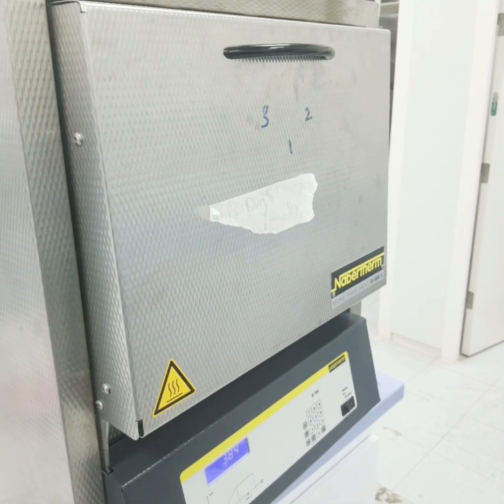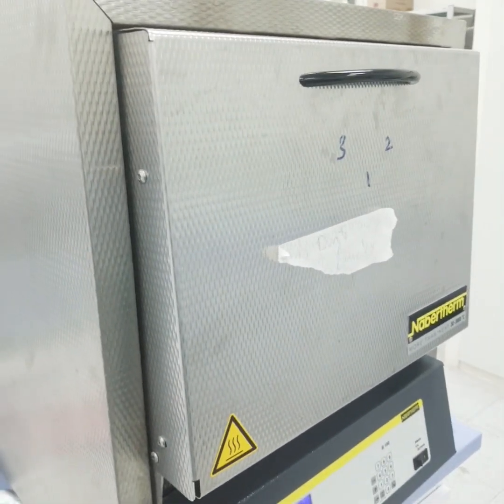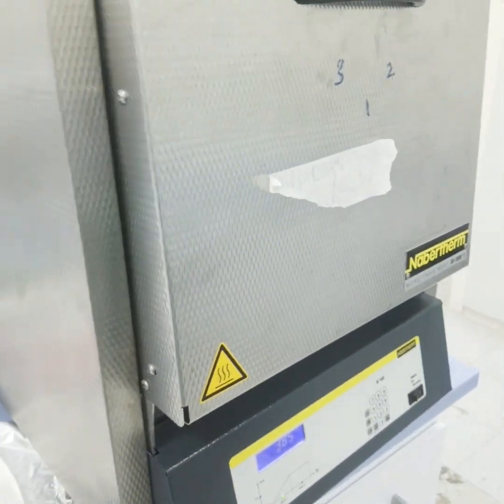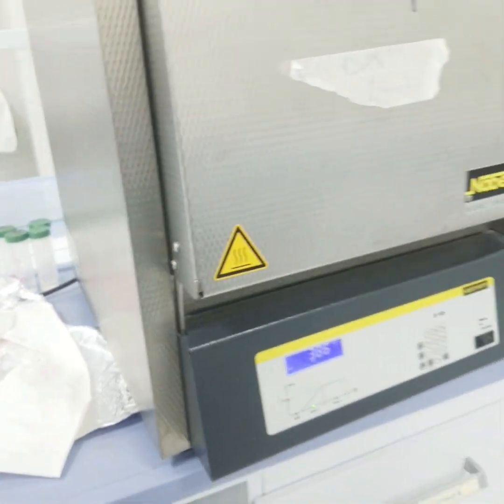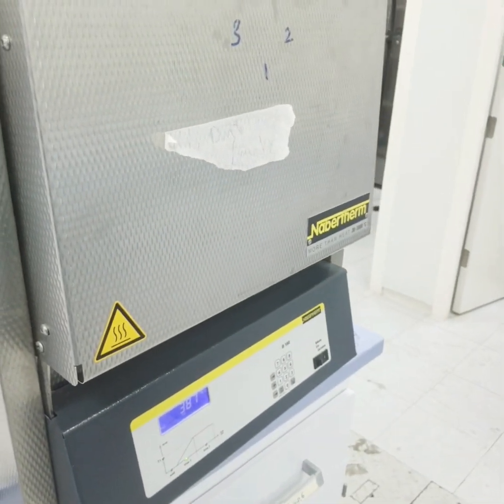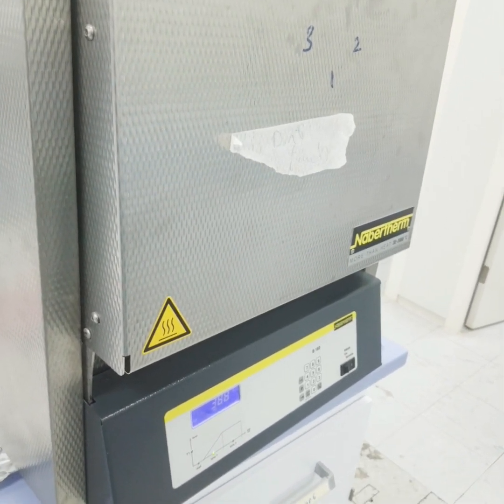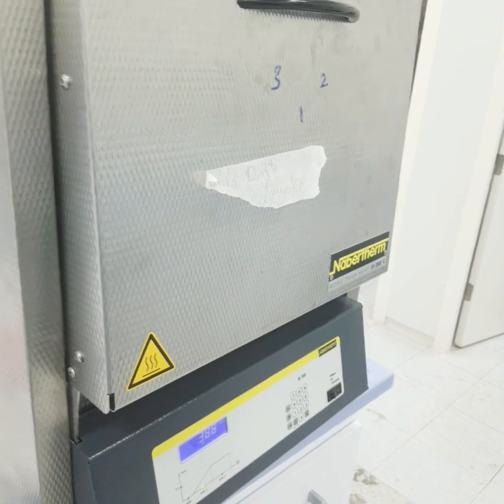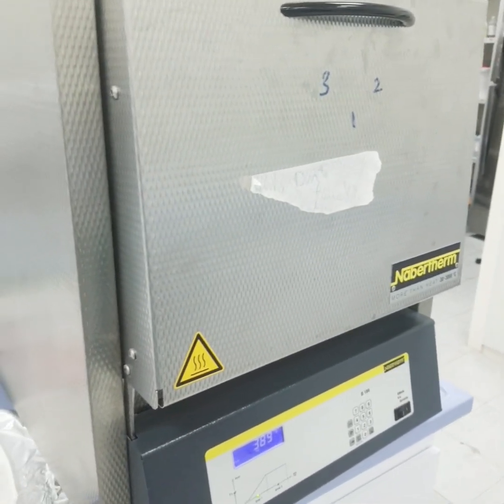filler unless the residue is less than 1%. Residues less than 1% are typically the result of additives that are not burned at the specific temperature, around 550 or 600. This is expressed as percentage ash, and the total ash content equals the weight of the ash divided by the weight of the original sample multiplied by 100.